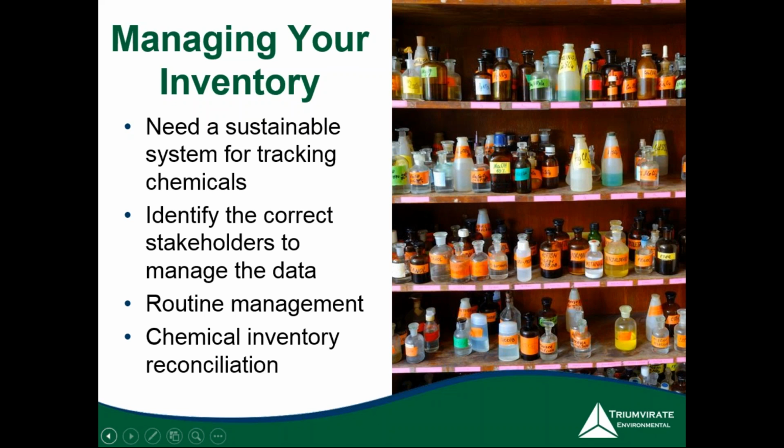Sometimes doing a chemical inventory and doing a reconciliation, those words can be interchangeable depending on how you do it. If you just do a chemical inventory annually or less than that, don't necessarily consider that a reconciliation. How the word is thrown around, at least how I've heard it, is that reconciliation is doing it on more of a routine basis and reassessing what's actually on site.